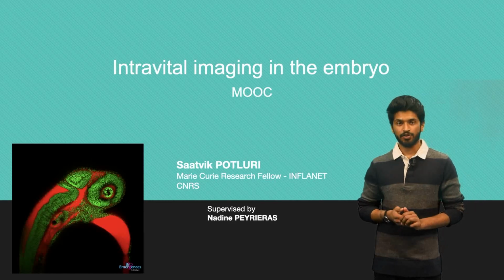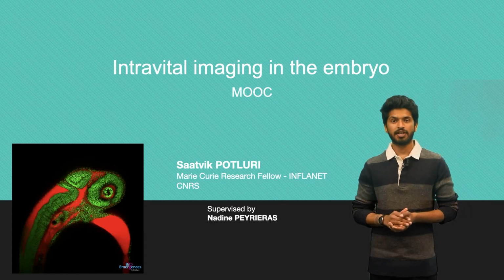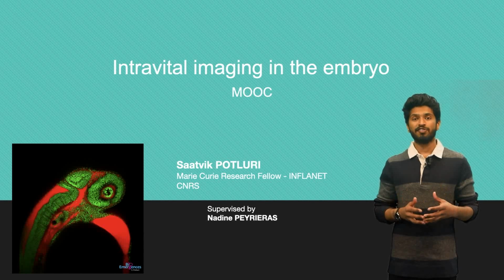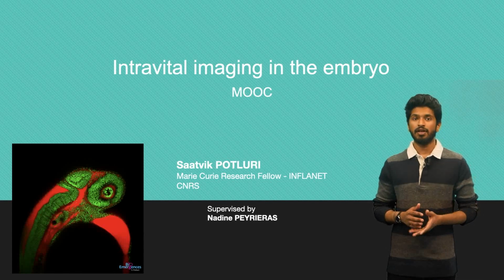I am Saatvik Potluri, a Marie Curie Research Fellow at CNRS, and in this MOOC course I will talk about intravital imaging in embryos and how they are performed along with the advantages of different setups.